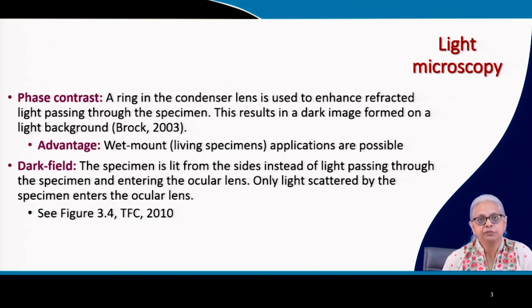Here I have two different modifications. One is phase contrast and the other is dark field. Here is a simple schematic that shows us the light path in bright field microscopy, in phase contrast and dark field microscopes. So we'll start with phase contrast.